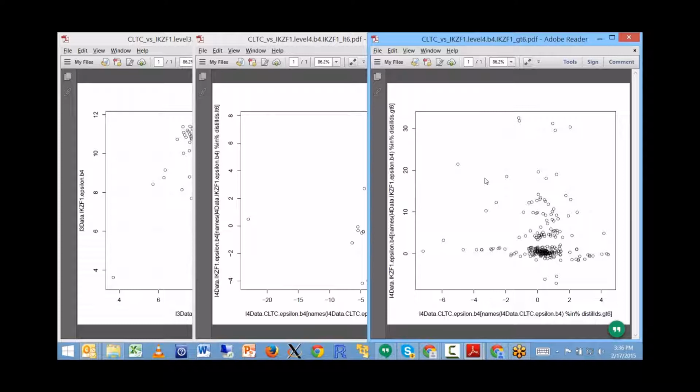No, I agree. I think this information that you get of possible pathological behavior is important, because I'm not completely convinced that whatever is done with data going from level 3 to level 4 actually accounts for that. So in this case, I think it would be really worthwhile knowing that these observations may not be right.